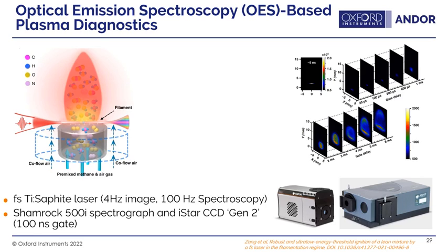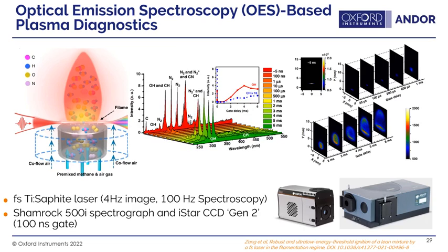What also happens in this experiment is that when they excite the combustion mixture, they create a plasma, and they can use optical emission spectroscopy of the plasma to characterize the different components in the plasma mixture as a function of time after ignition. Here they're looking at the different concentrations of the OH and the CH radical as a function of the gate delay time after ignition. And this provides them information and insight about the mechanisms of the flame formation and of the combustion reaction.